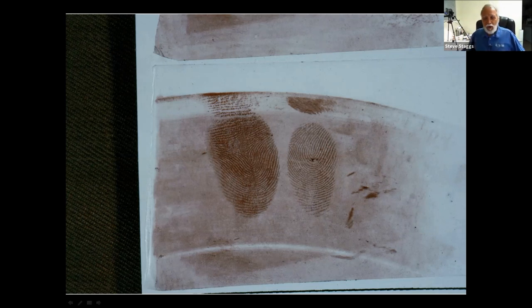Let's do something simple like dust with black powder to develop a latent fingerprint — going from moisture and oils in the latent itself. It might be that we use some oblique lighting and now we see the latent, so we're going to develop it further so we can see it more clearly. Or maybe we just have a surface and say 'I think the suspect touched this, I'm going to check,' and then you dust the surface and find some prints.